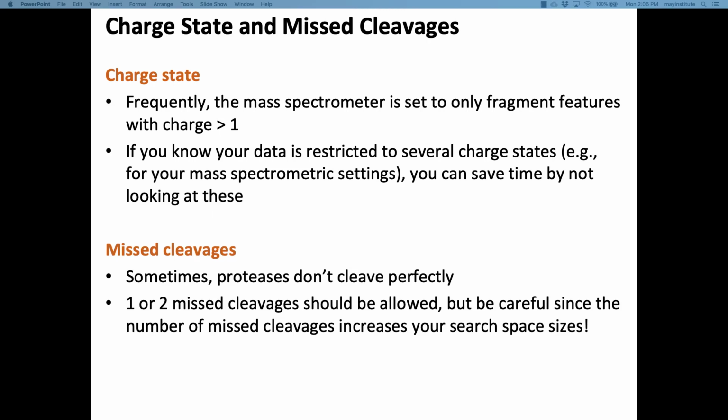Another thing to keep in mind is the charge state. You should only consider charges larger than 1 for various reasons. Have you any idea why that? Why greater than 1? Is 1 charge enough? Because the ion source and the sign of the charge both contribute to the charge state. Yeah. If you have tryptic peptides, you basically get one charge for free. So they should already have two charges, potentially more if they have additional amino acids that can bear a charge on the side chain.